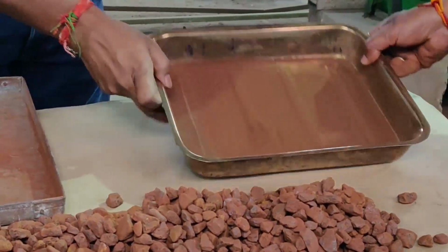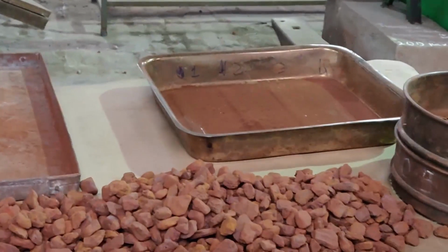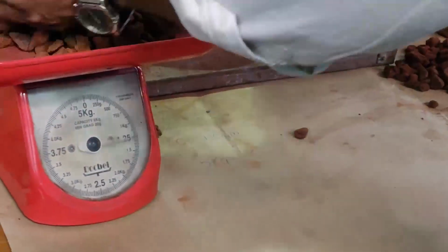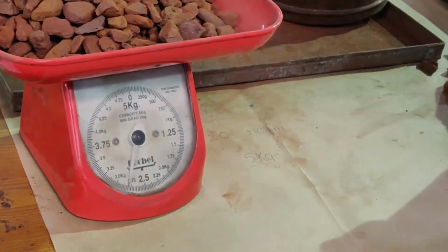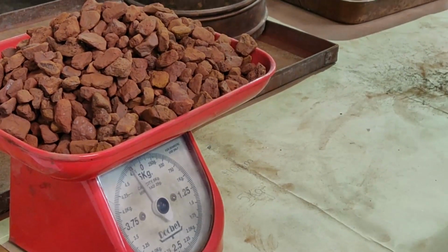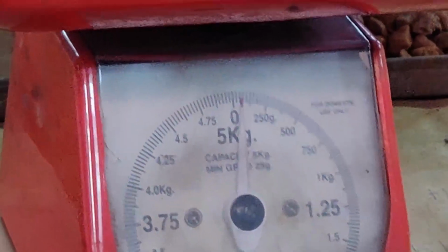Now we will weigh the two fractions, minus 0.5 and plus 6.3. This is the minus 0.5 mm fraction weight.